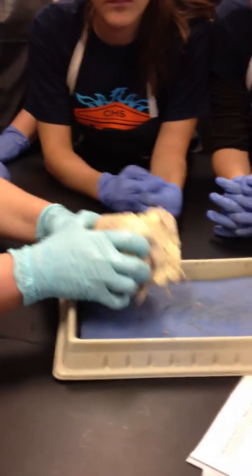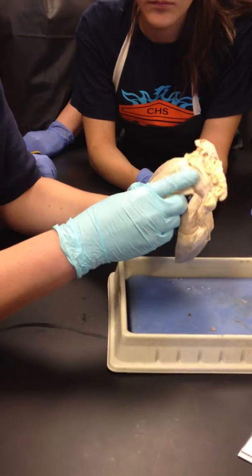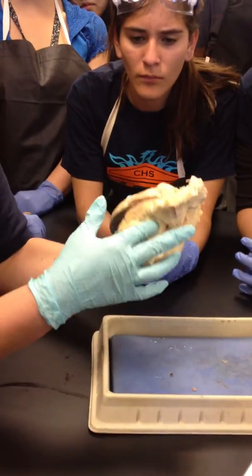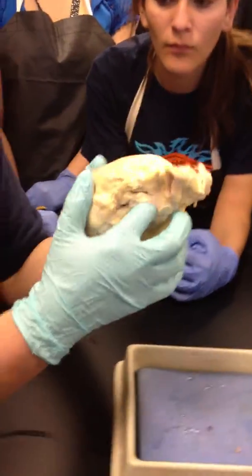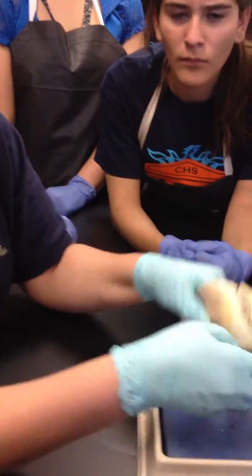If I had a go-go gadget finger, that would be amazing. You can see my finger right there, and this is the pulmonary trunk right here. In fact, if I enter into this area, my fingers should meet, and they touch right there. So my fingers are touching. That's the pulmonary trunk.